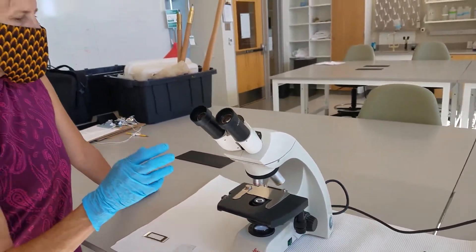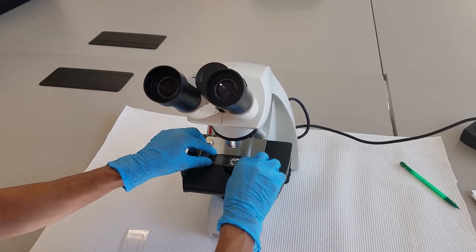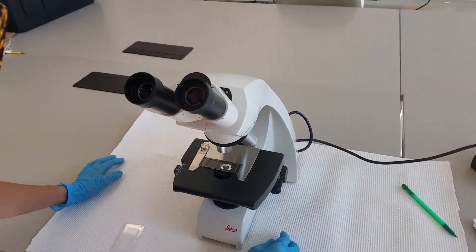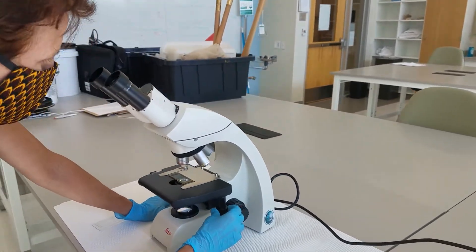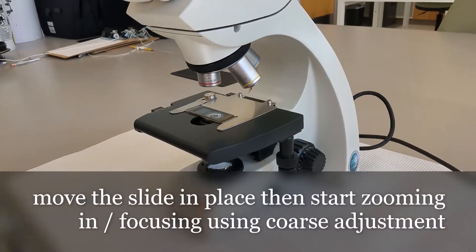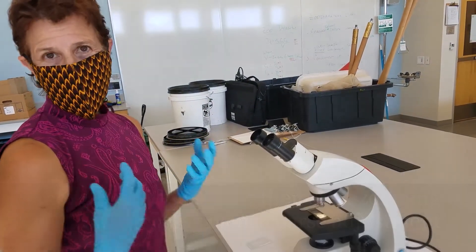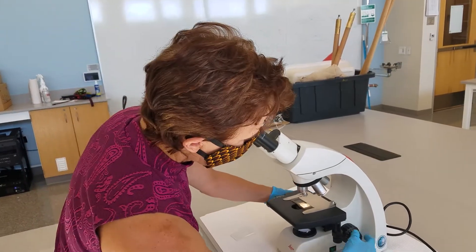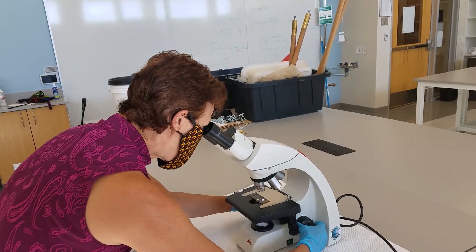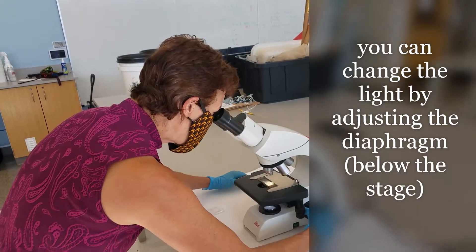Put the slide on and make sure that holds it. Then move it right towards the center. The first thing I do is I'm going to zoom in so that I start seeing some organisms, using the coarse adjustment on 4X to do that. During this process, you may also have to change the amount of light coming through the bottom of the slide.